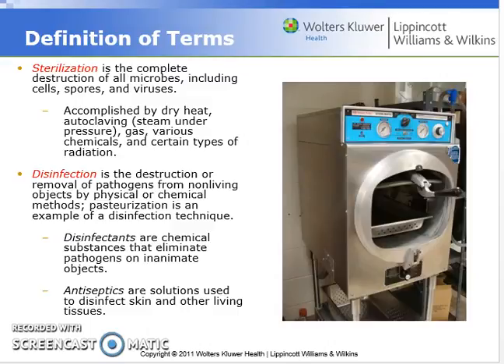Now, the autoclaves are used to kill all the microorganisms that we work with in the laboratory setting. It does so by increasing the temperature to about 121 degrees Celsius, which is incredibly hot, and it also increases the pressure. Once the pressure increases to about 15 psi, you have the breakdown of the microbial organism's cell through the process of pressure, and once that happens, we're able to kill the microorganisms.